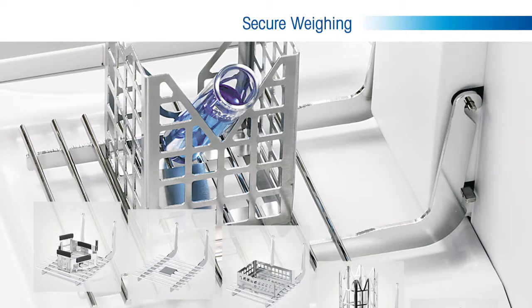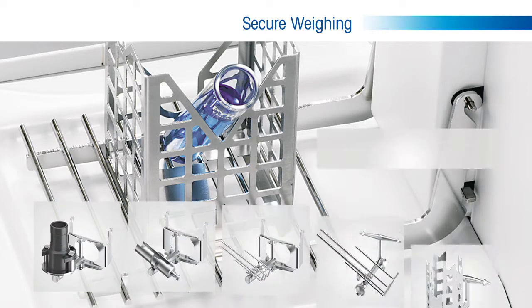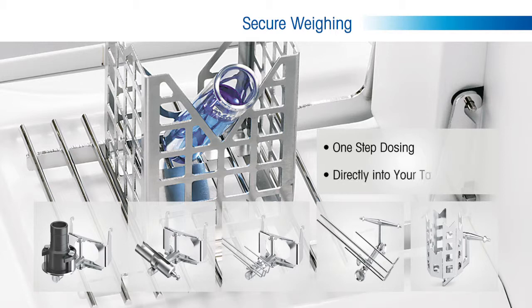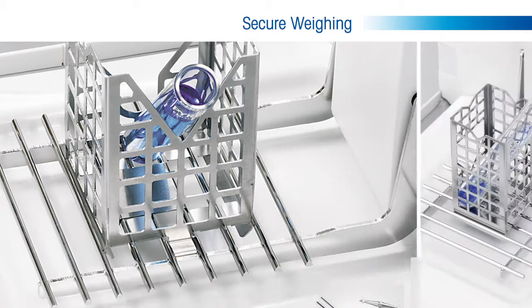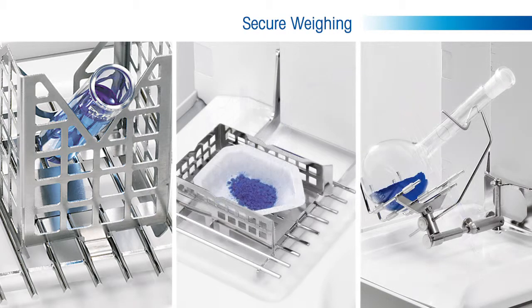Mettler Toledo has addressed this concern with their patented ErgoClip offering. These unique products allow for one easy step dosing directly into your tare container.